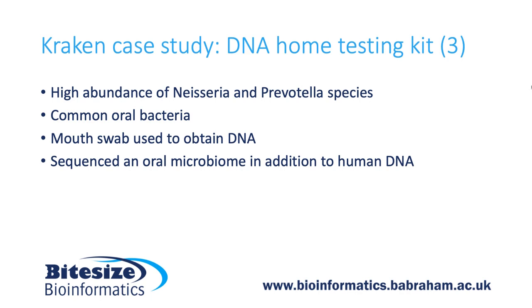You'd place this in the mouth, rub it against the side of your cheek, and then you'll be able to collect cells from the side of your cheek. But no doubt, while doing this, you also transferred a large number of oral bacteria onto the swab. So these bacteria would be on the swab, go through the library prep and be sequenced. So we believe that what's actually happening with these home testing kits is we're getting a large number of reads back, but a significant proportion of those are actually just sequencing the metagenome of the mouth, which you may argue is interesting in some ways, but was not exactly what the person who performed the home testing kit was actually interested in.